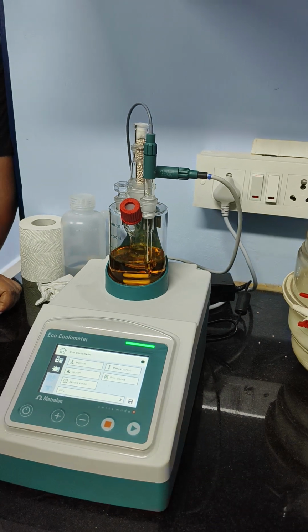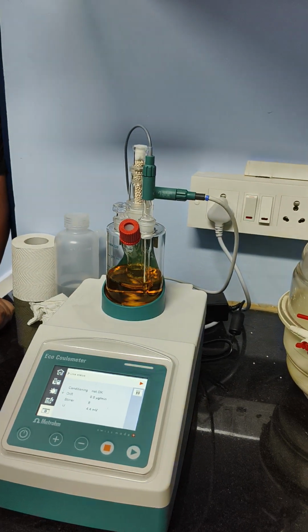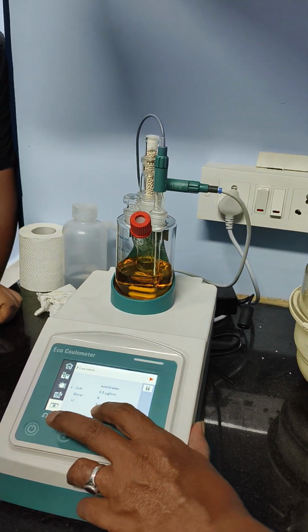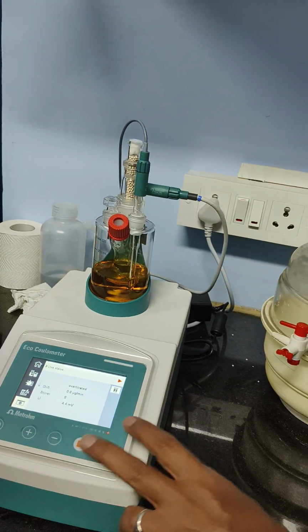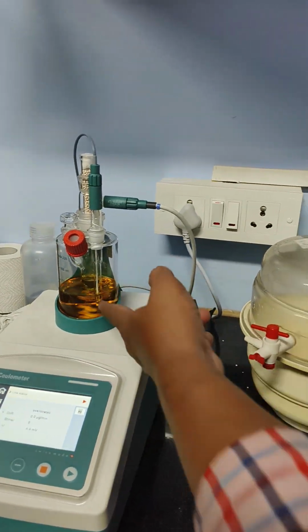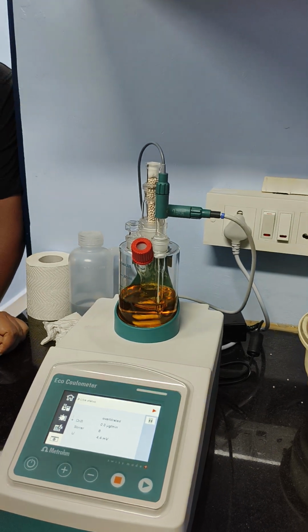Once you start, the machine will start and it will indicate the value here. The drift value should come below 20 and the potential should come less than 50 millivolt. Right now drift is 0. That's what I told before adding. After adding, I told, this has already been used.